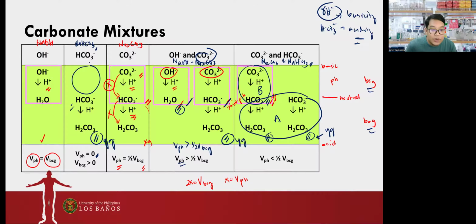Okay? So these are the volume relationships as you do your preliminary determination of the composition of your carbonate mixture. So, importante sa ulo natin, yung mga volume relationship. Actually, kahit hindi sa ulo. Basta you can deduce the meaning behind these volume relationships, okay na kayo, kahit hindi siya sa ulo. Okay? Pero if you want to learn it by memorizing, okay lang din. Pero much better if you can deduce it on your own without even memorizing the volume relationship.